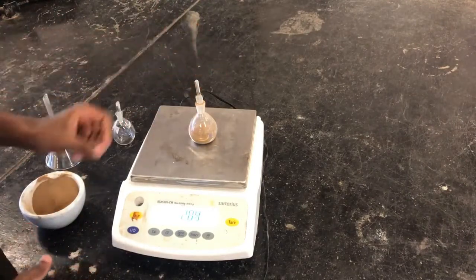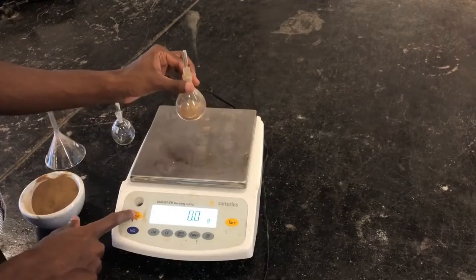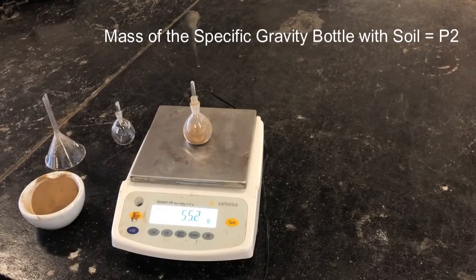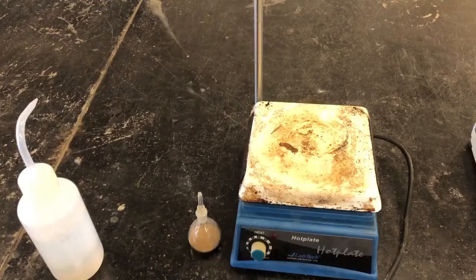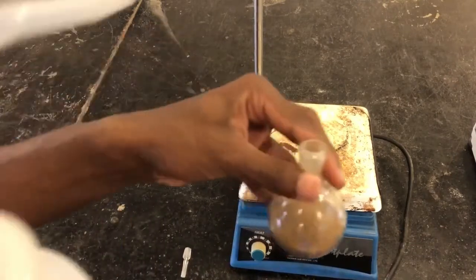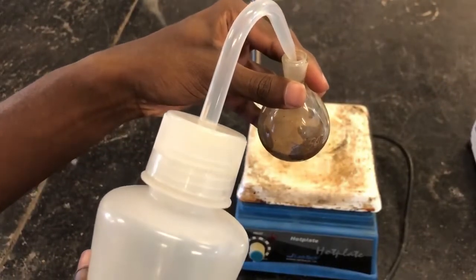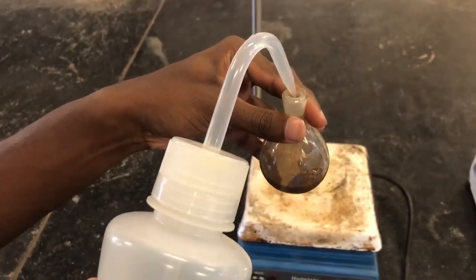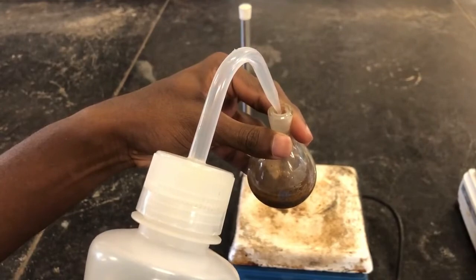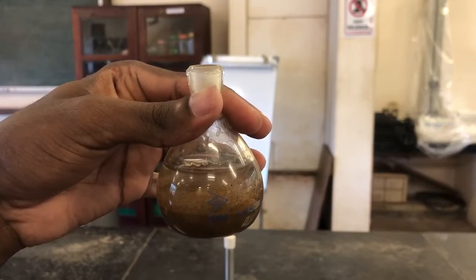Close the stopper. Now take the weight. This is the weight of the specific gravity bottle plus the soil sample. Now remove the lid of the bottle and add about 3/4 volume of distilled water to the specific gravity bottle with soil. Now you can see the 3/4 is filled.